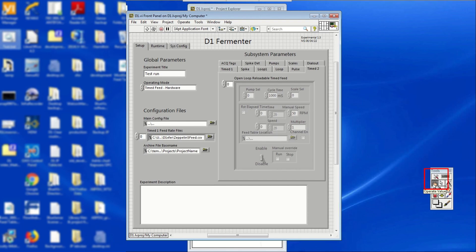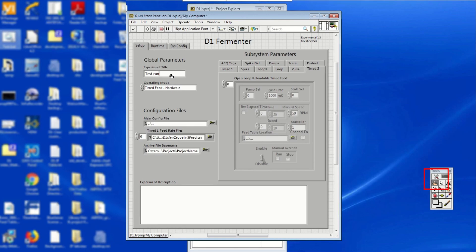Now is a good time to change the cursor to operator value. To do this, locate the tools bar, which is usually in the lower right corner of the desktop screen. Then, click on the operator value cursor, which has a pointing finger icon. This step is to prevent any unintentional changes in the front panel layout.